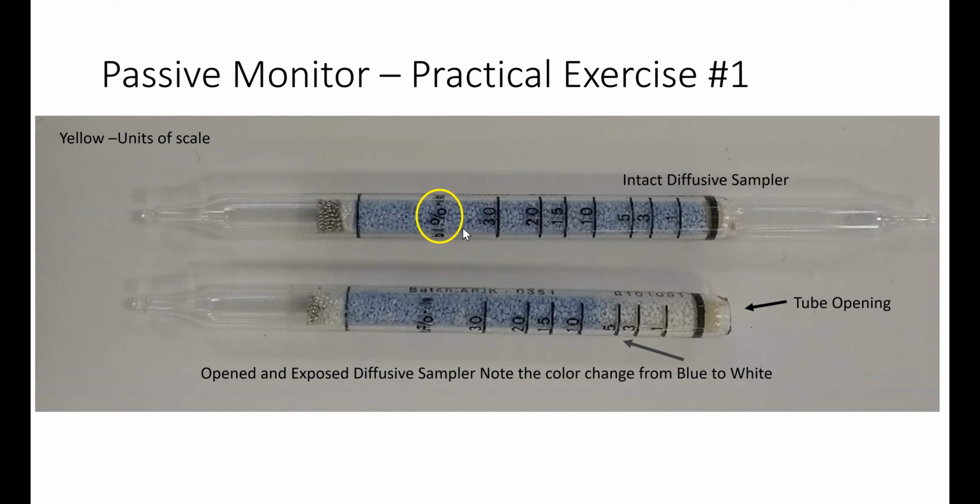If you notice, the units of scale are right here. It's a little blurry, but you can see that percent, and there's a dash, and it kind of goes over here. If you look right here, it says percent dash hour. Those are the units of our tube, okay?